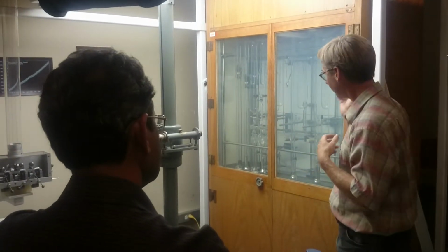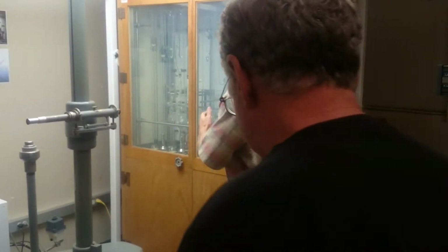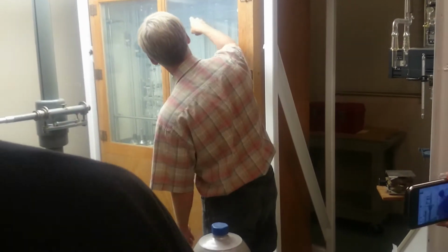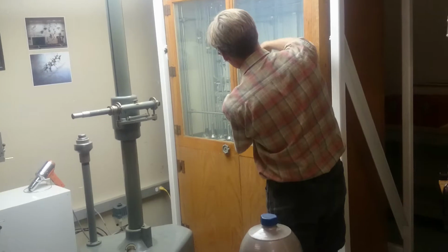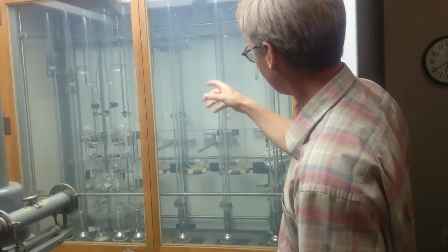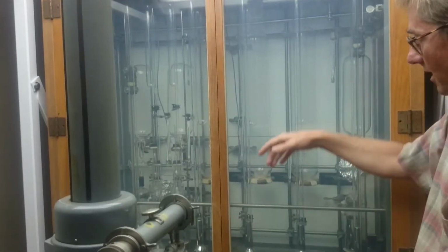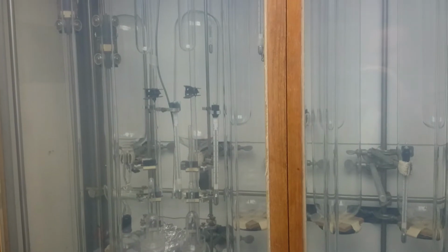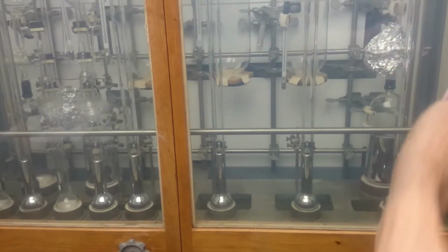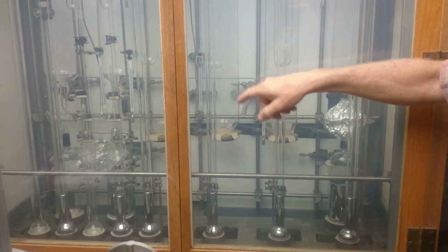It worked very well. So this manometer has a series of columns of mercury here, but the truth is that this is redundancy. All it really needed was one of these large volumes back there. See the thing back there about this big as a glass flask? That held the original dry air sample. And you would measure the temperature by these thermometers in here. There's these amazing glass thermometers. You can read out to a hundredth of a degree. You measure the temperature, and you establish how big that volume is by filling it with water and weighing it. Okay, so he knew the volume, he knew the temperature, and he measured the pressure because he could look at the connection between that. There was a connection open initially between that chamber and this chamber over here.